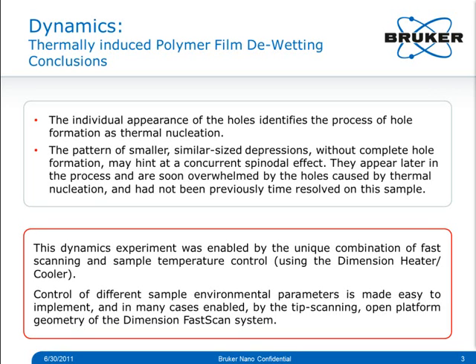Looking further, most other methods of triggering dynamic processes can also benefit from the tip scanning design and open platform of the Dimension FastScan, and it will be much easier to develop them, or for technically savvy labs, even to invent and integrate such setups themselves.